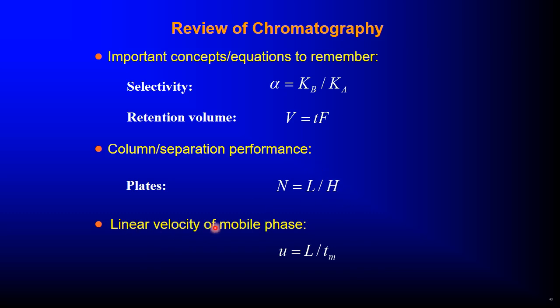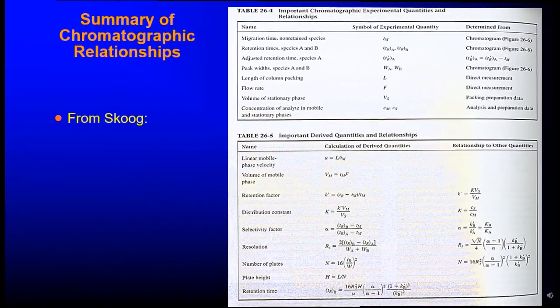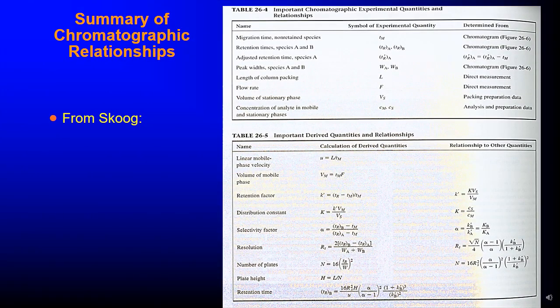Then we have linear velocity of mobile phase, which is the length divided by mobile phase time.